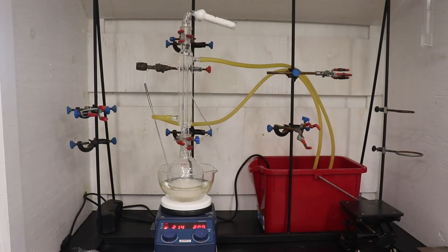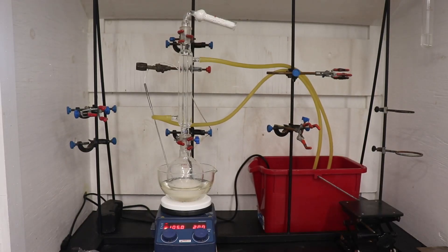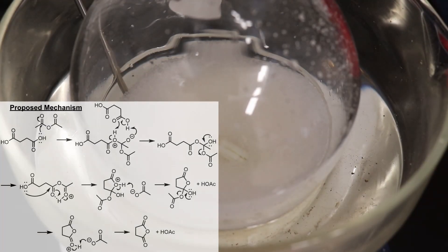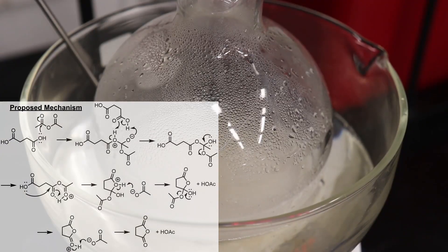The apparatus was arranged for reflux, and a calcium chloride drying tube was added to protect from atmospheric moisture. The flask was then set in an oil bath at 105 degrees Celsius to allow for the heating of the reaction mixture.